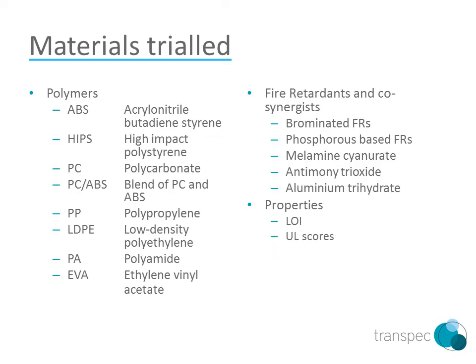Gnosis has already worked closely with a number of major additive producers and compounders, and thus has an experience in a vast range of thermoplastics, flame retardants and additives that are constantly being added to. We have also started to predict properties like LOI and UL scores. In other areas of research we have also predicted aging and lifetimes, melt flow indices and many other properties using the TranSpec concept.